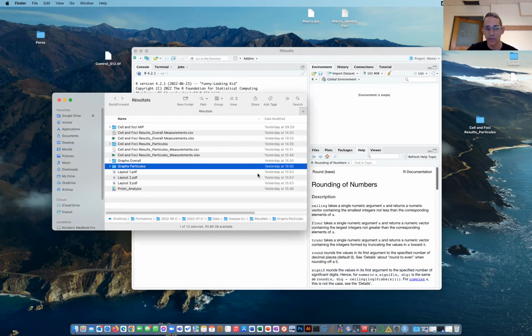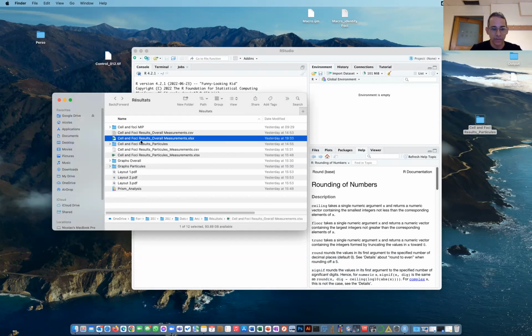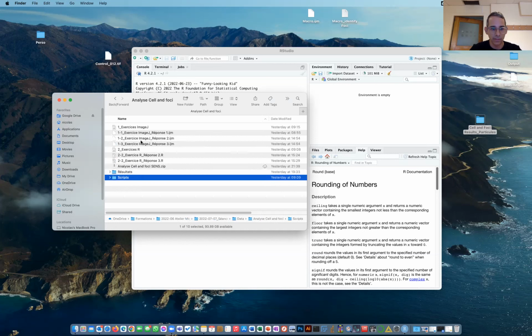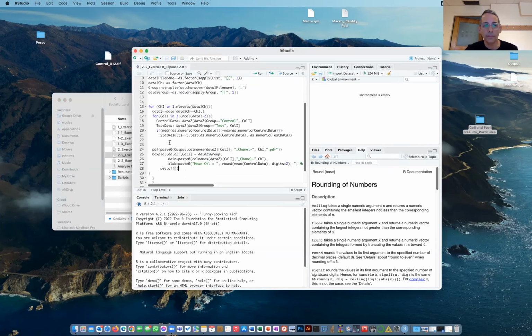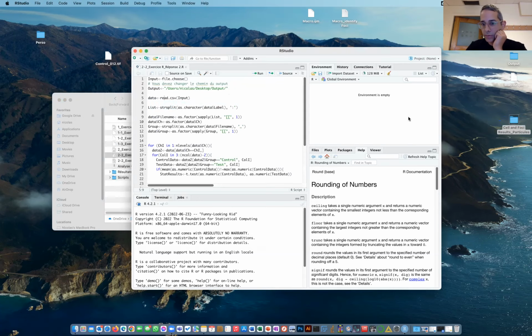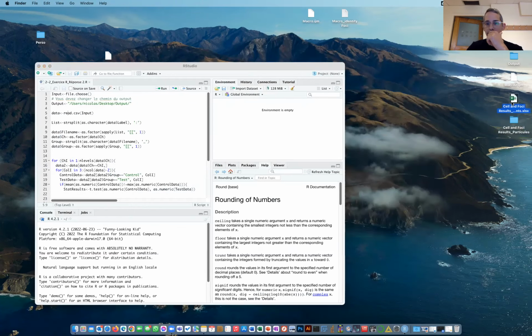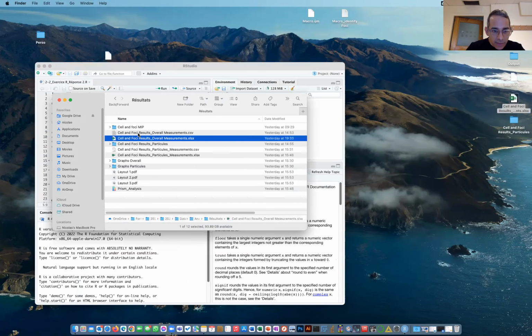I wrote some scripts to process the data we have generated, and I'm going to load these scripts and go through them, if I find my scripts. There. Okay, the first script reads data located in this file. Actually, I don't need the Excel table. I need the result CSV table. There you go.